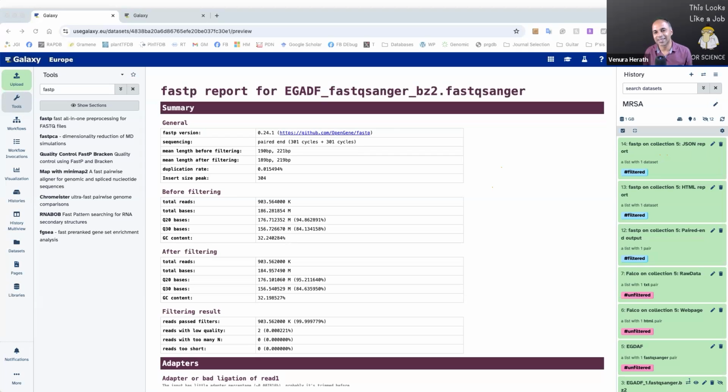Okay, so the idea here is we have our reads, and we are going to map them into a taxonomic tree based on a pre-built database. In very simple terms, let's say we have 10 species, and we know all the taxonomic levels for these species. We feed in our reads and see what kind of taxon or taxonomic hierarchy they are going to match.